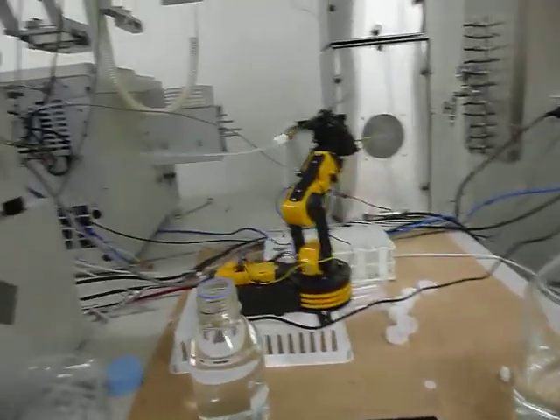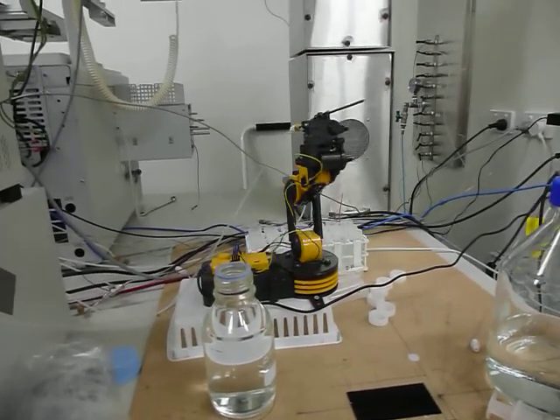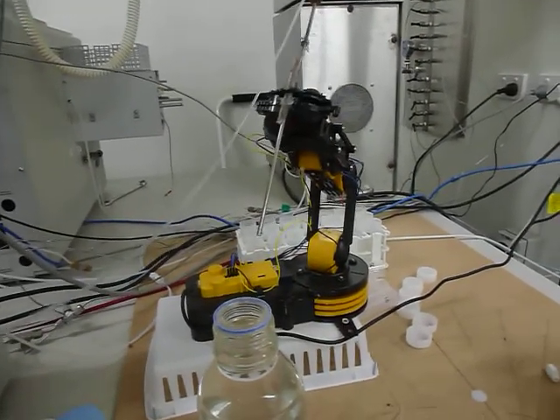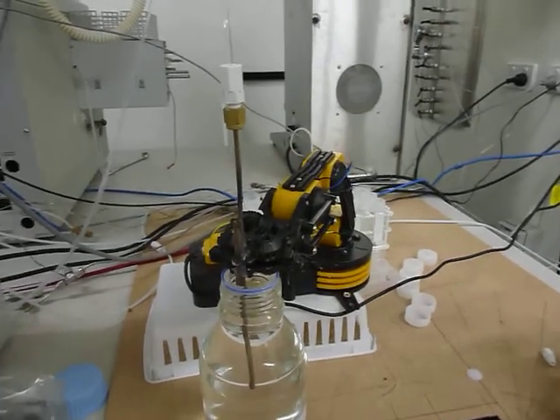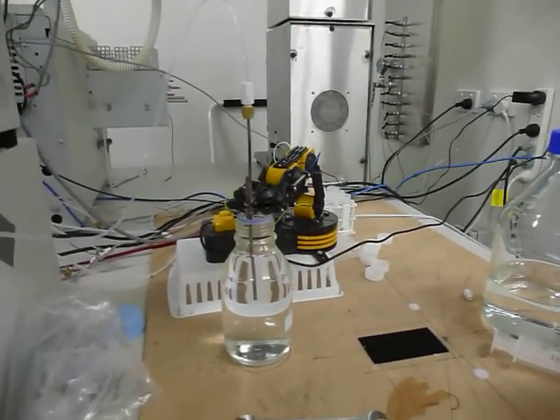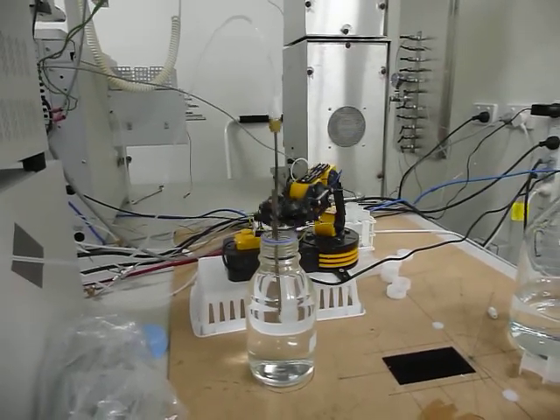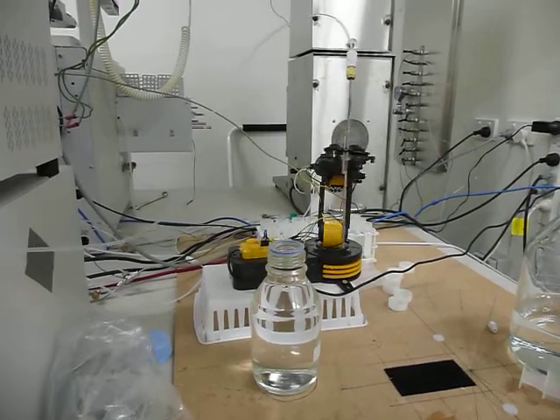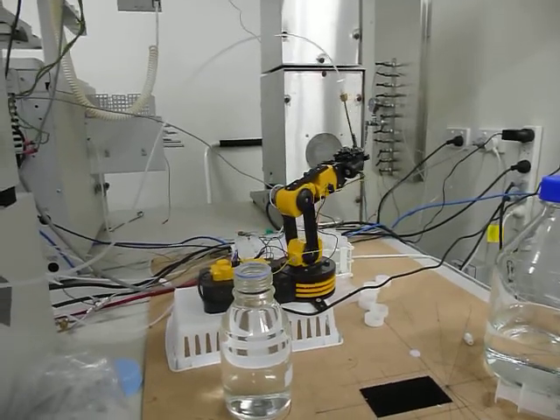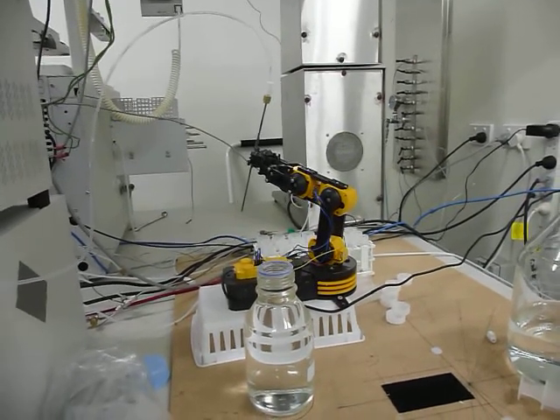So now it's going to the rinsing station. The rinsing station is this bottle here. It stays here for a few seconds just to dilute the water outside the needle. It's probably not the best cleaning technique. I'm still thinking about refining this. Ideally some running water would be used, probably, followed by a rinse in a bottle like that. Yeah, I'll think about that.